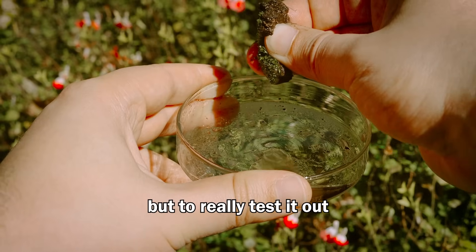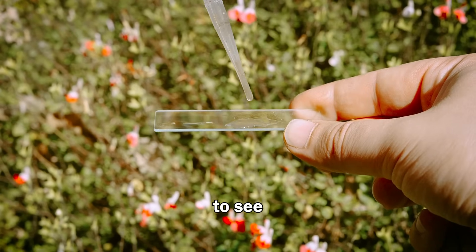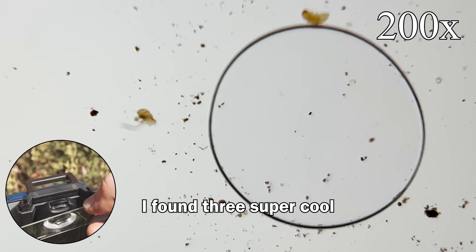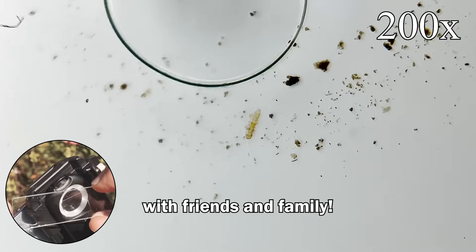But to really test it out, I just had to know — is the Phone Micro 5 by Apexel strong enough to see water bears? I'll let you take a look for yourself. I found three super cool water bears, and the coolest part was that I could record it directly to my phone and share the footage with friends and family.